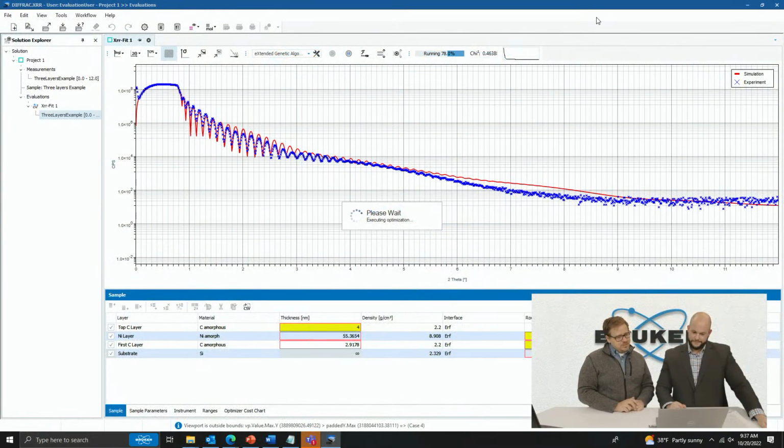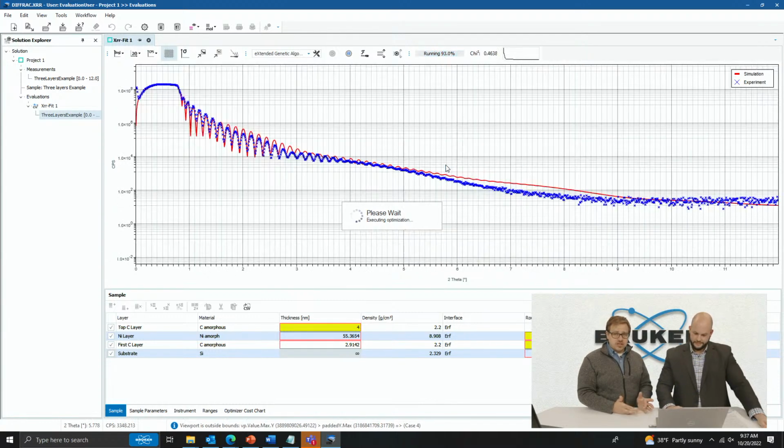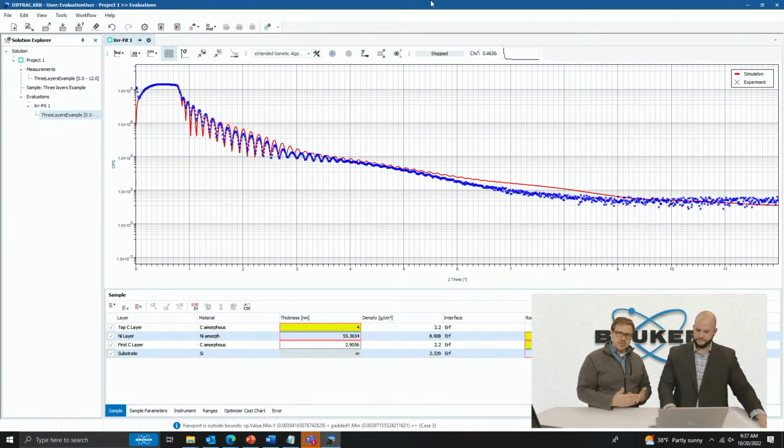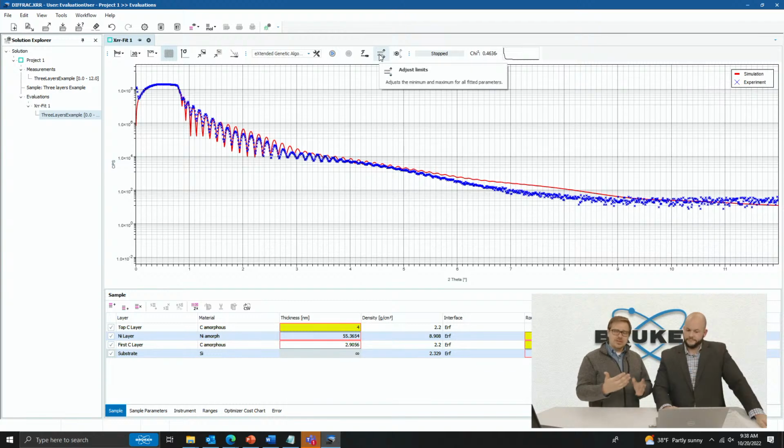So looks like here we're coming down to that fit. Yep. So you can really see it kind of walking in. Yeah, you definitely can. Even over here in this region, it's just a little bit offset. And this is the thing about the genetic algorithm, the time it takes to find the solution is actually determined by the number of variables that you're using and then the settings in the genetic algorithm. Yeah. Because it takes its current state and then it recalculates based on the variable space and the number of different children. In a genetic algorithm, you have the current state and then you have the child states right after that. So that's why that one sometimes takes a little bit longer. But you can go in, edit the settings, make it go faster.